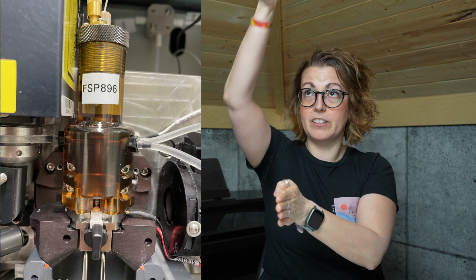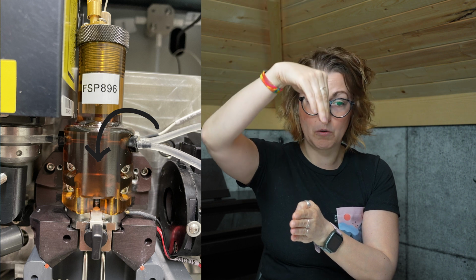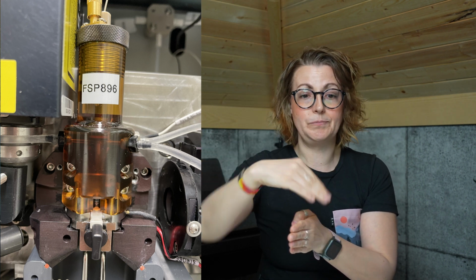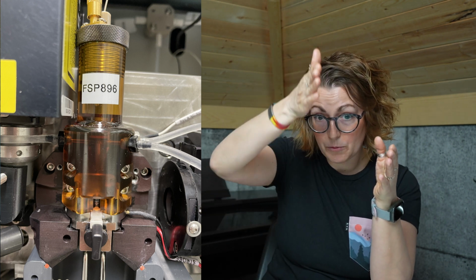The major difference here is that in most cell analyzers, the cells flow upwards. They're taken up and passed vertically through the flow cell. Whereas in a sorter, the cells are taken up and then loop and go downwards through the flow cell. So that motion allows for the cells to be put into a nice downward stream that can be sorted. At the bottom of the flow cell, you'll find something called the nozzle.